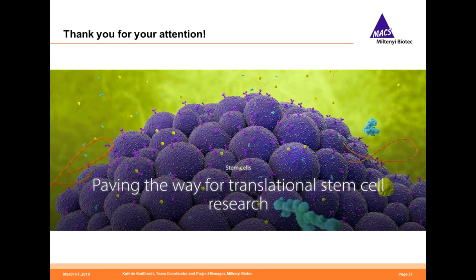Other bioreactors don't include the DGC process. Therefore, the starting culture cells contain many other cells, for example, erythrocytes, and of course, the proliferation is not very efficient in this way. Furthermore, the growth and the detachment can be observed partly under the microscope when we use the Prodigy process. Therefore, we have better control of cell growth and harvest. Other bioreactors are not able to observe these under the microscope. For example, when you think about hollow fiber modules, or when you use a carrier system, the harvesting step is also always a little bit tricky.